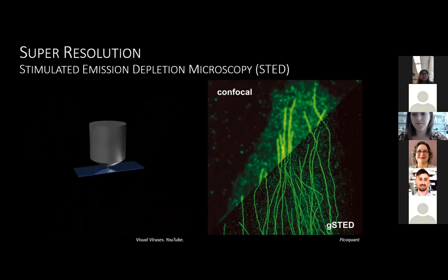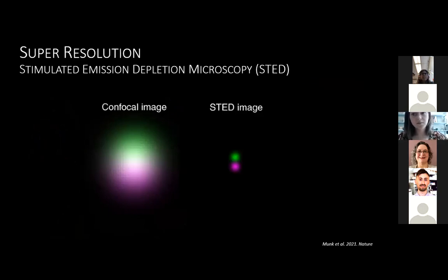they're a lot more spotty, but that's because we're looking at individual proteins, and we can see that they have increased resolution. So the reason I'm talking about these is because we hear a lot about co-localization analysis, and if we look at a confocal image of protein A and protein B, and we did our Manders coefficient or our Pearson coefficient to determine how co-localized our 2 proteins are, we would say that they are co-localized.